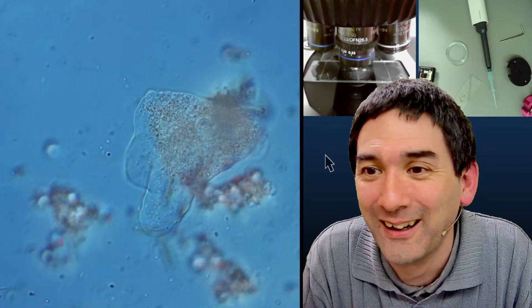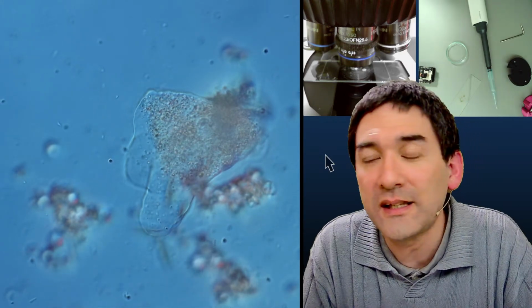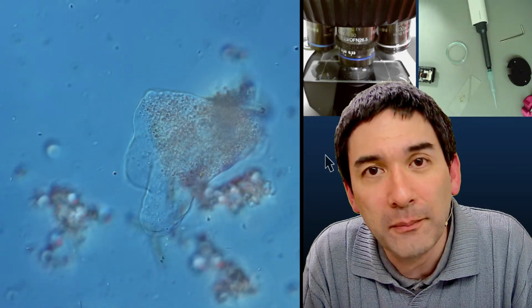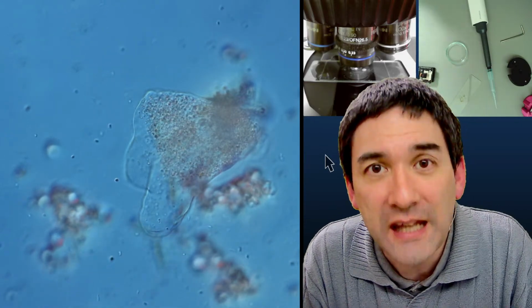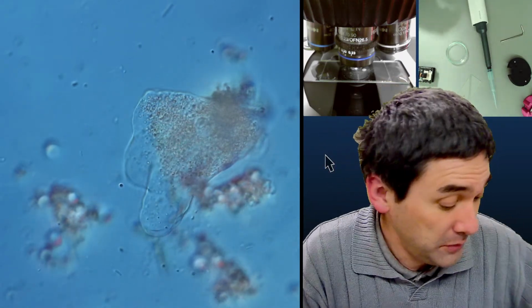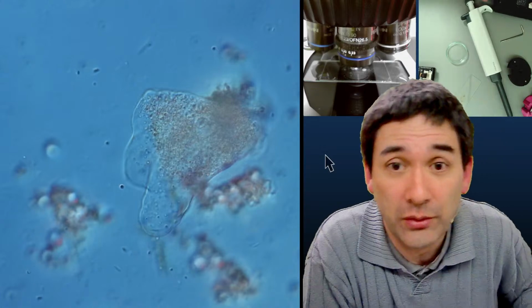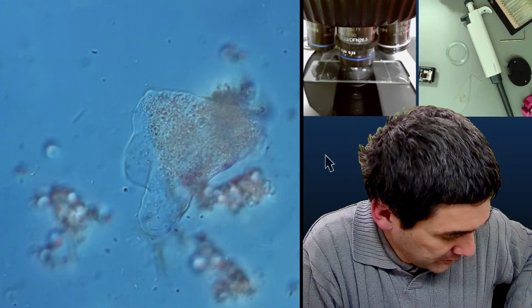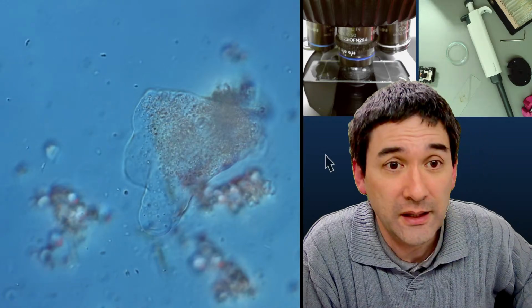Not anymore. Can you see chromosomes? That's another interesting thing. It is difficult. You have to stain them and then you're able to see chromosomes. And as a matter of fact, because you're asking, I'm going to show you some chromosomes using a permanent slide.